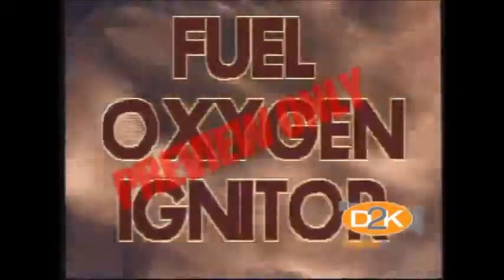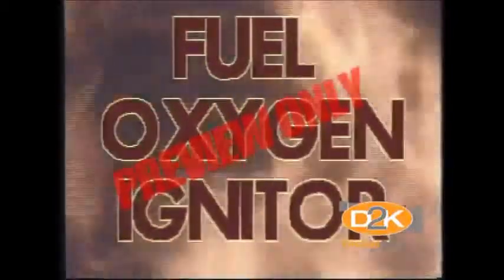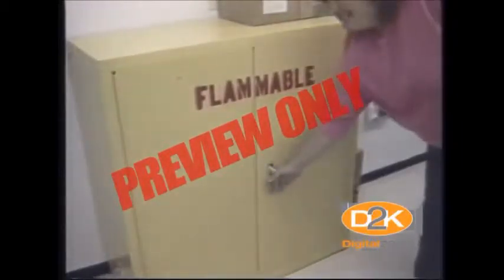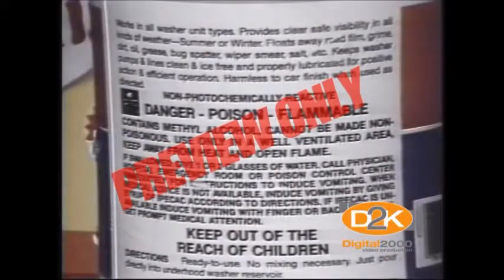To have a fire occur, you need basically three things: the fuel, such as gasoline, oxygen, and a source of ignition. That source of ignition could be a match, a spark, or even static electricity. When the proper mixture of oxygen and fuel are present, that mixture can be ignited by a source of ignition. We want to emphasize flammables, as anytime you handle flammable liquids, you need to know the hazards and take precautions to reduce the risks.